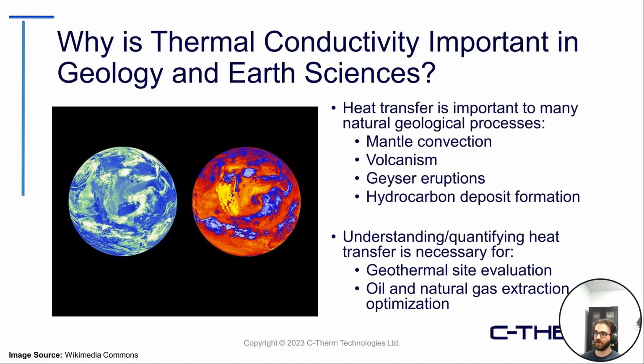So, where does thermal conductivity play a role in geology and these different earth sciences? Mainly anytime heat transfer is an important aspect of some type of process. A few examples: mantle convection, volcanism, geyser eruptions, hydrocarbon deposits. Really being able to quantify that heat transfer gives a better knowledge of how these processes are occurring.